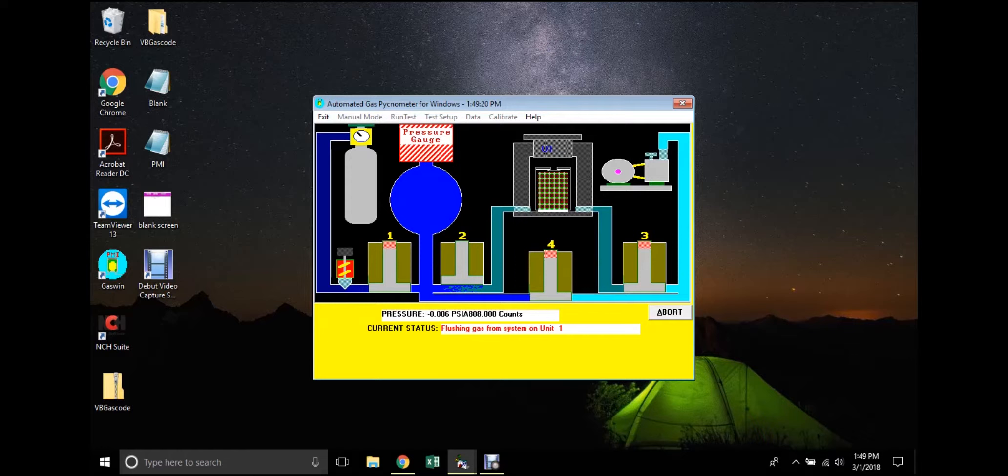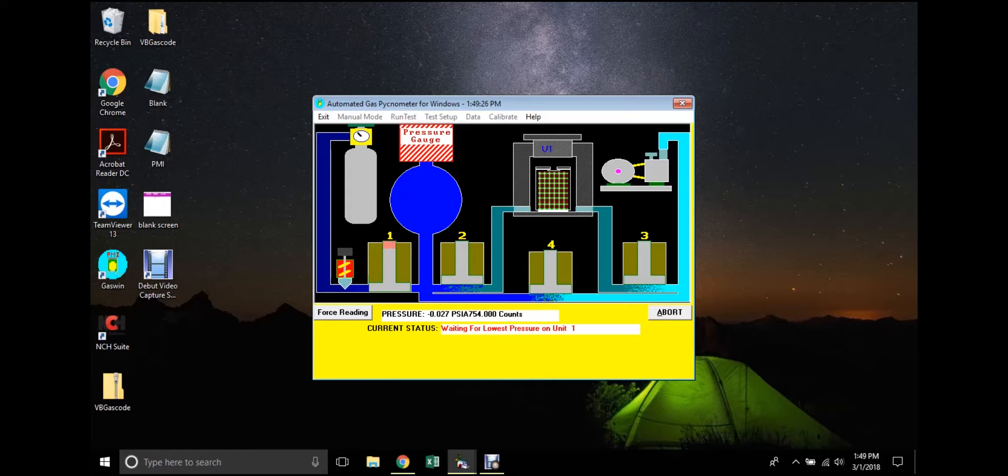Conditions for the test, such as pressure, counts, and status, may be monitored from the window as the test progresses. If, for any reason, the user must end the test before it is complete, the abort button may be clicked.